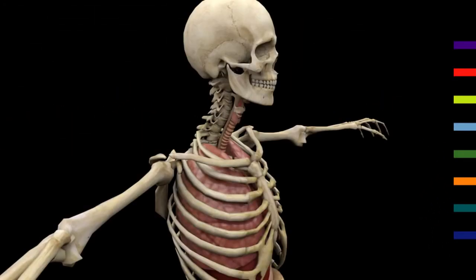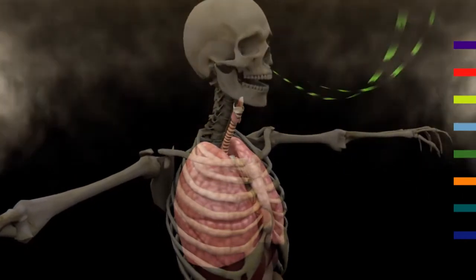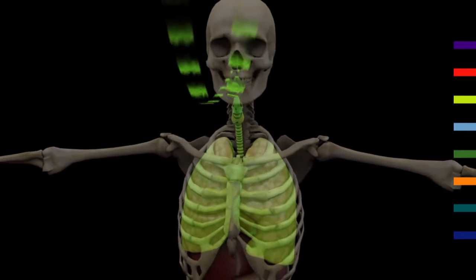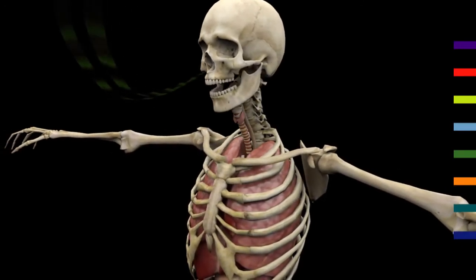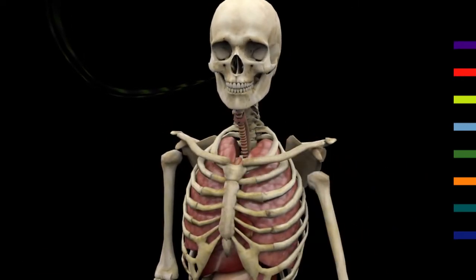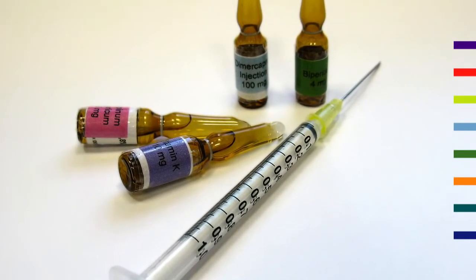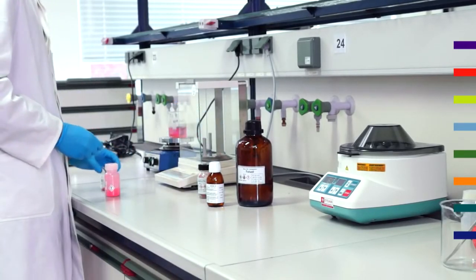The most common way of exposure for the human body is via inhalation. It is a lot simpler to prevent oral incorporation or resorption via the skin. As soon as a toxic chemical gets into the body, it is distributed via blood circulation. Irrespective of the symptoms experienced in the area of exposure, specific effects in the body occur. The local effect on the place of exposure of the skin or the mucosa, for example chemical burns by bases or acids, is irreversible. On the other hand, the resorptive effects are often reversible as long as countermeasures are taken in time. The general rule is avoid contact with dangerous substances.